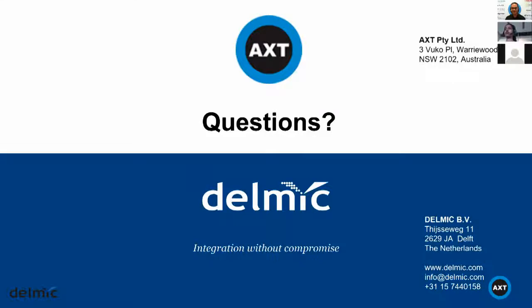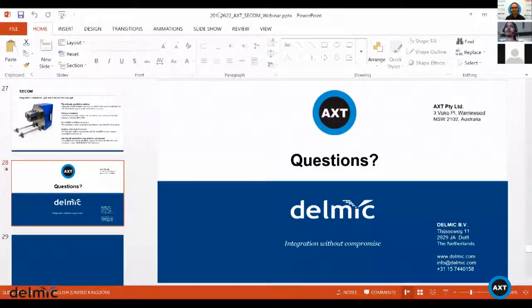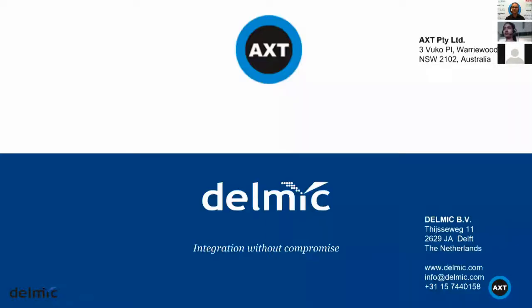Thanks very much, Sangeetha. It was a great presentation. So please, guys, if you have any question, write it down in that Q&A part in the bottom of your page. I have a couple of questions about the SECOM. Can you please explain how you install the SECOM platform? How difficult or easy is it to replace the door of the SEM with the SECOM, and how long does it normally take?